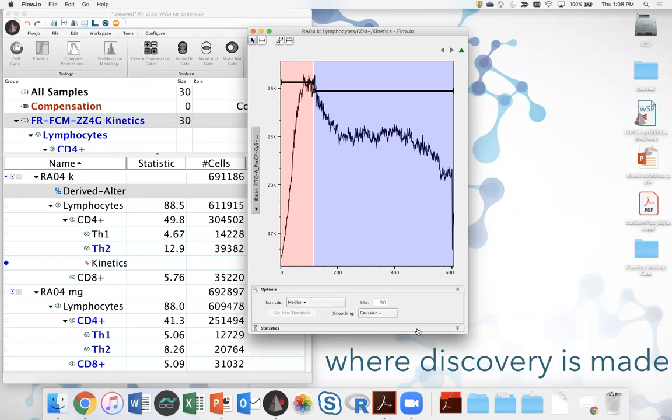I think either one's okay, and I think it helps resolve the data. It takes a little bit of the noise, the variance of individually measuring thousands and thousands or tens of thousands or hundreds of thousands, as the case may be, of cells in this case, and smooths it out so you can see the pattern. So either of those are fine. Maybe we'll stick with the Gaussian average here.